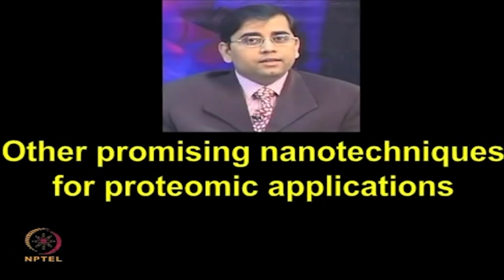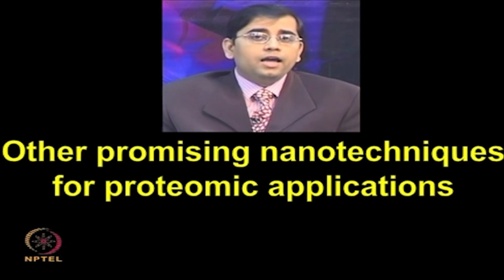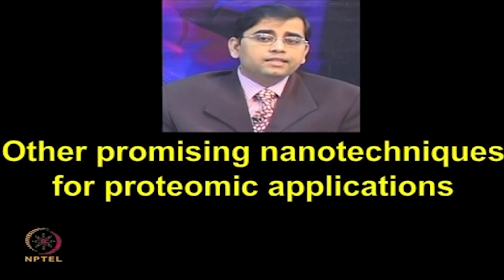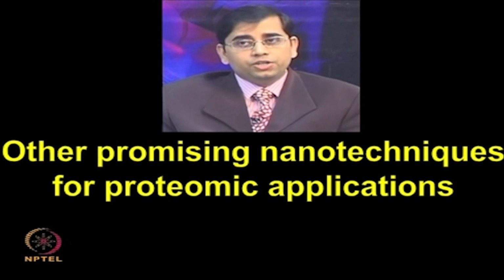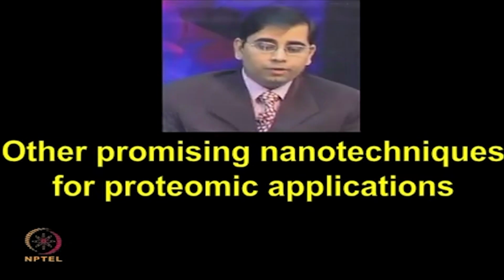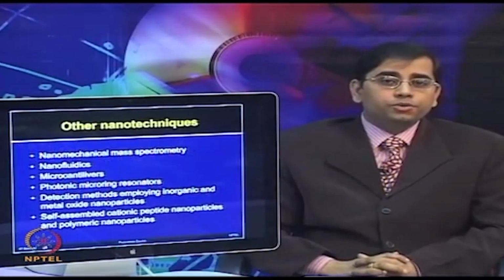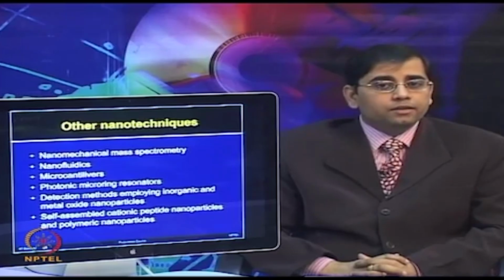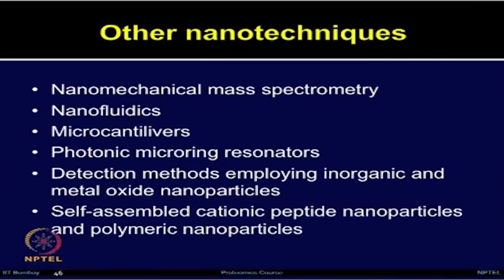So, there are various promising nanotechniques at various stages of development. They have received increasing attention due to their higher potential for proteomic based investigations. Although the success of these nanotechniques is still very limited, it has potential and significant impact for the future proteomic applications. These other nanotechniques include nanomechanical mass spectrometry, nanofluidics, microcantilevers, photonic microring resonators, various types of detection methods which employ inorganic and metal oxide nanoparticles, self-assembled cationic peptide nanoparticles and polymeric nanoparticles.